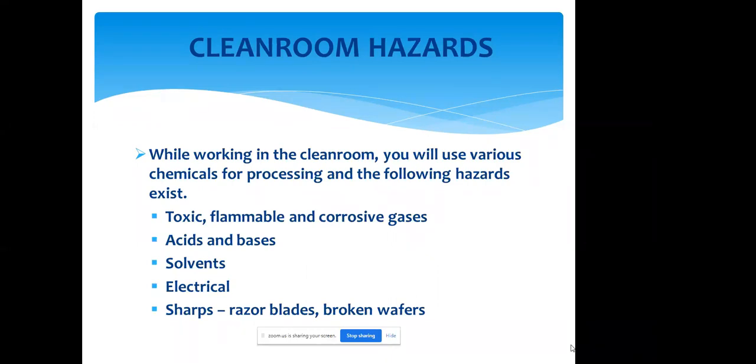Some of the hazards would be, in our clean room, we have toxic gases, we have flammable gases, corrosive gases, we have the really nasty acids and bases, we have solvents, we have high voltages. Even your broken wafers can turn into a hazard if you break it and you cut yourself. So you really have to come in with a clear mind and watch out for what's going on.